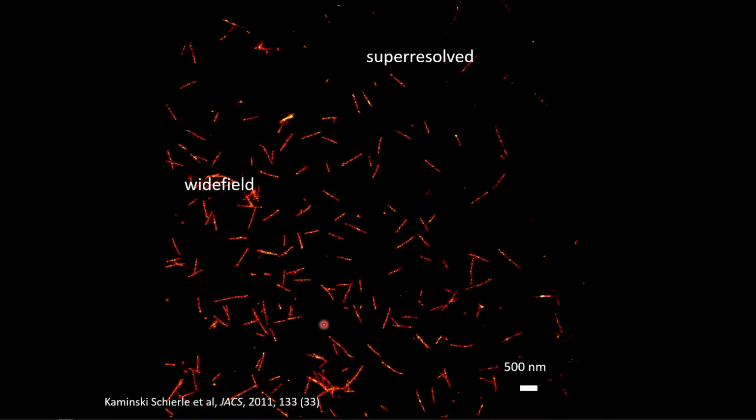So we really see life at the molecular scale directly. The only problem is that generating this image takes 5 minutes of data acquisition, and it takes so long to switch. So this is the general principle that I mentioned right at the beginning: you trade time for resolution. Space against time. It's a Fourier transform pair, it's all nicely related. If I want more information about the spatial dimension, I have to give up temporal information.